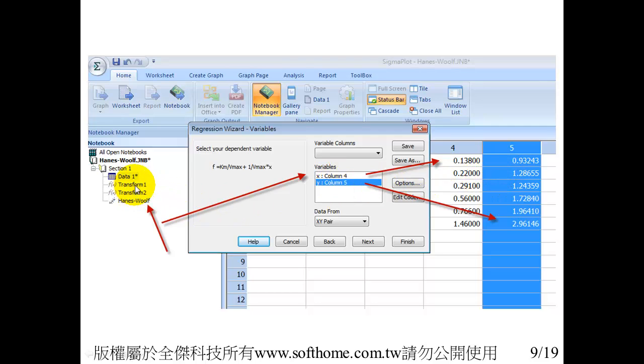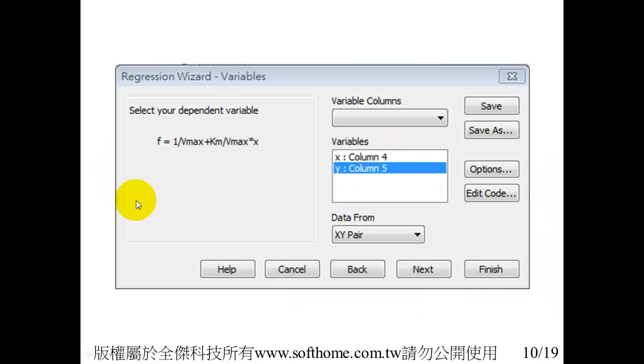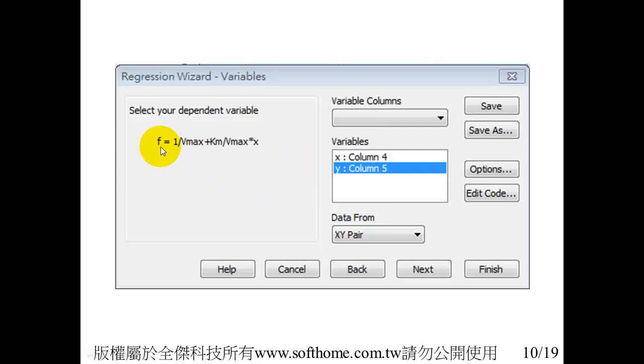Use transform one, this transform. It's already in SigmaPlot. If you are our customer, we can send it to you. And then we use the user-defined regression. You can see the formula here. You must put the X and Y correctly in column four and column five.